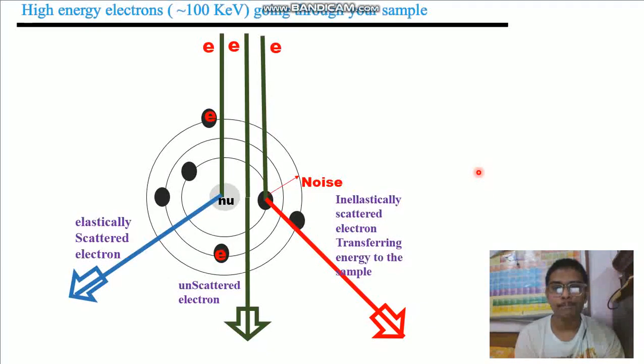Now the point is how the transmission electron image looks. This is a peculiar type of transmission electron image. Here are some virus pictures which have been captured by the transmission electron microscope. You can see this is a black and white picture, an old-days type of picture, not like today's colored cinema. As we know, old is gold.